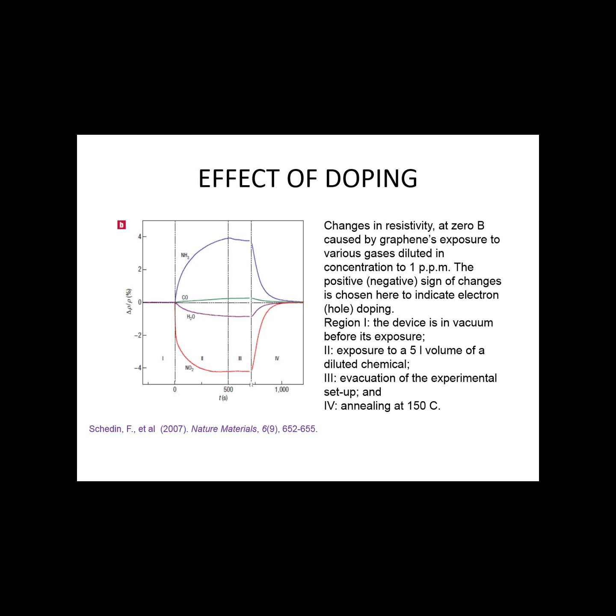In this case, for example, you can use graphene as a gas sensor, which is the advantage, but the disadvantage is that if you put foreign materials down on graphene, then its conductivity, its resistance will change, and this is again as a result of charge transfer. So a visual way of mapping and imaging these charge transfer domains also becomes very important. So that's basically a brief introduction to graphene. I think I can hand over now to Greg to show you the actual results on the KPFM.